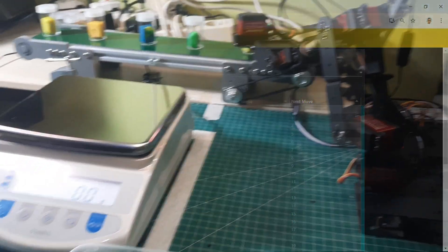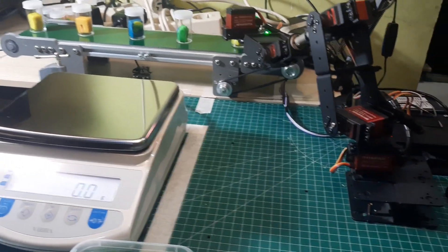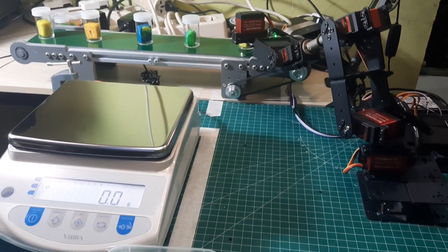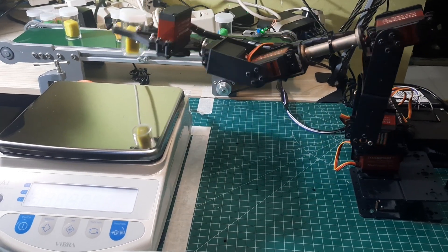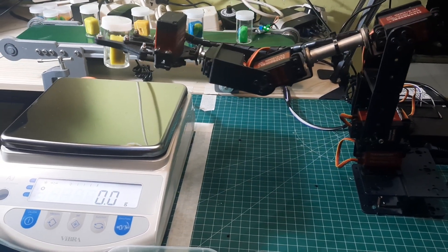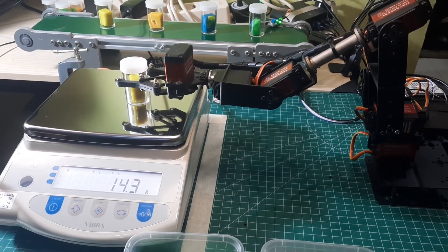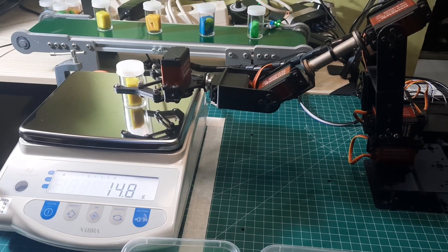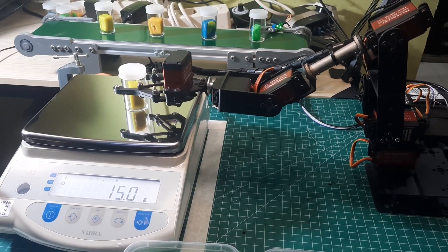This is the condition when the program is running. The robot will pick up a cup object from the conveyor and bring it to the analytical balance for weighing. In this video, the weight standard is 15 grams with a tolerance of 0.2 grams.